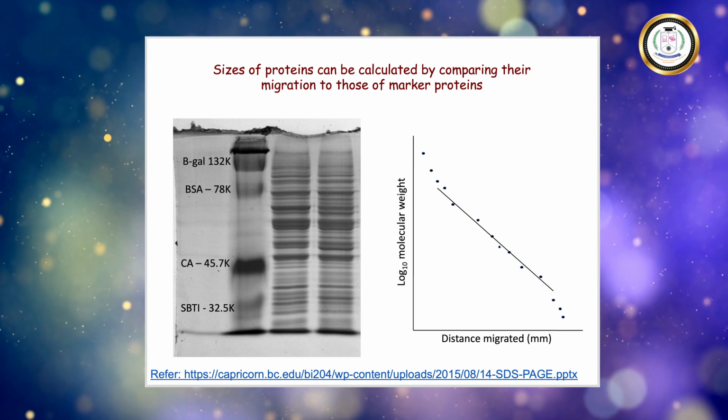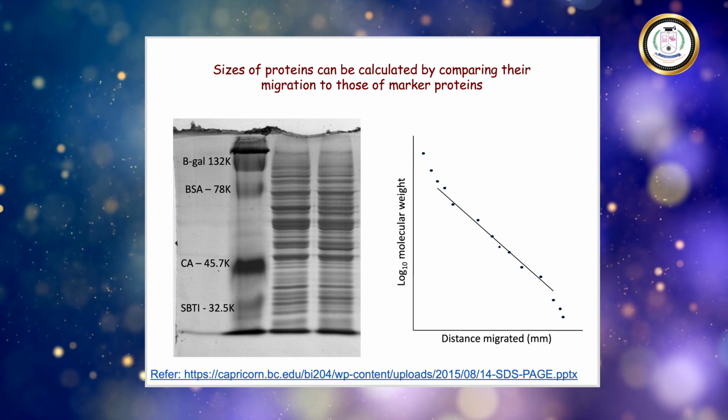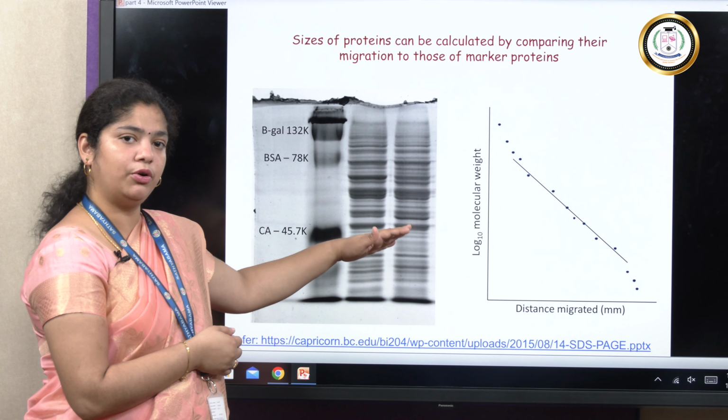Here we can see that the higher the molecular weight, the nearer it stays to the top of the gel, whereas the lower molecular weight goes to the end of the gel.